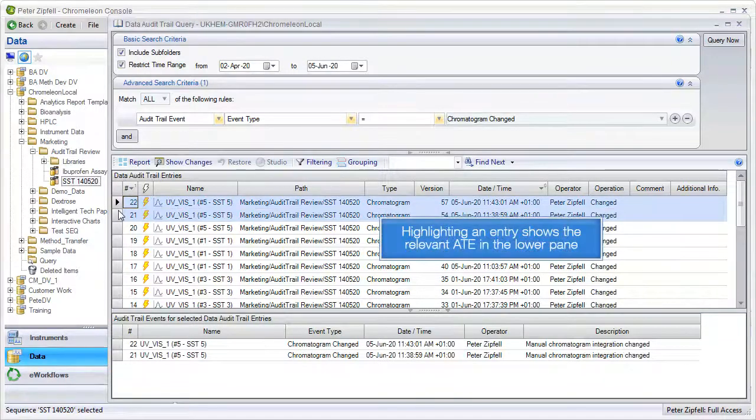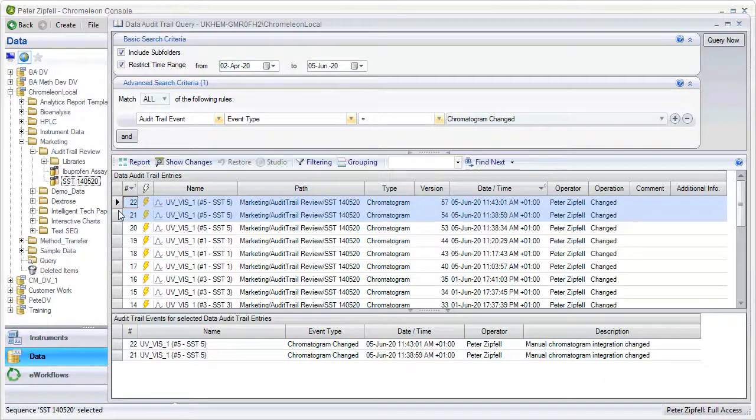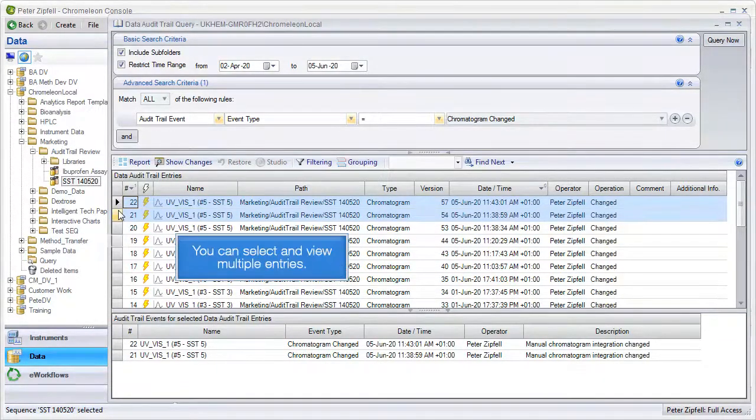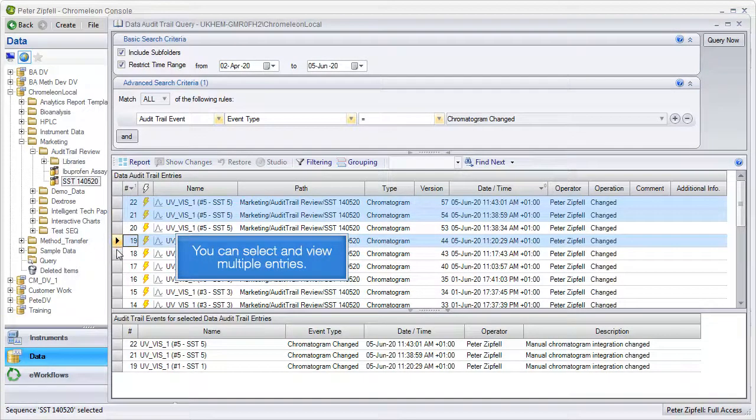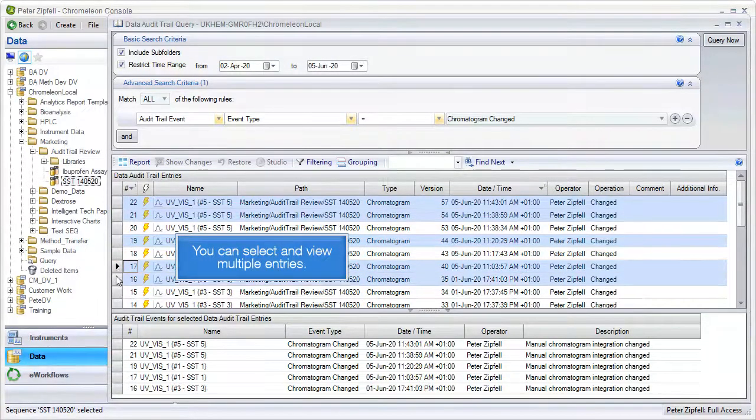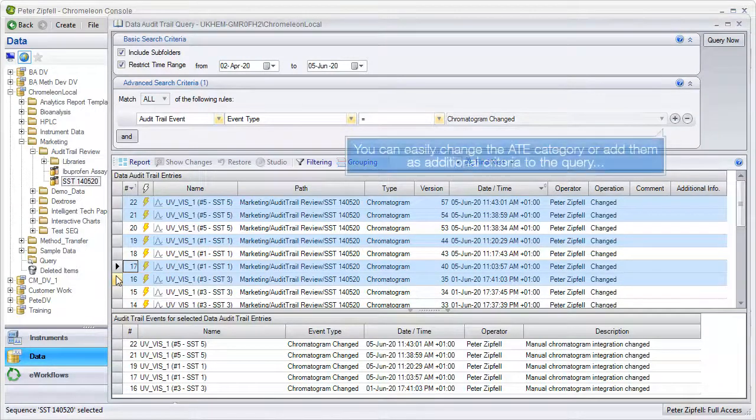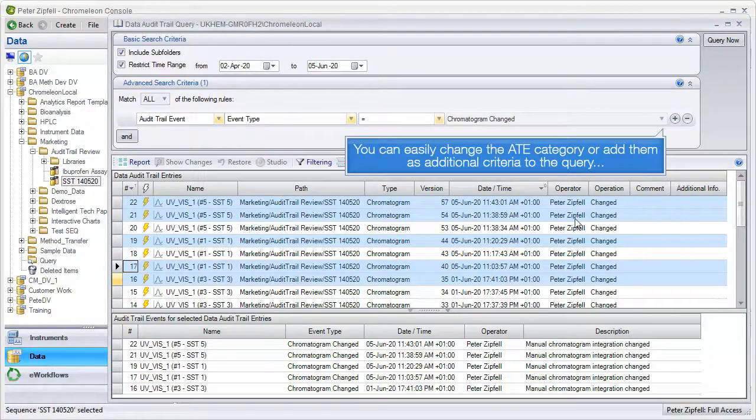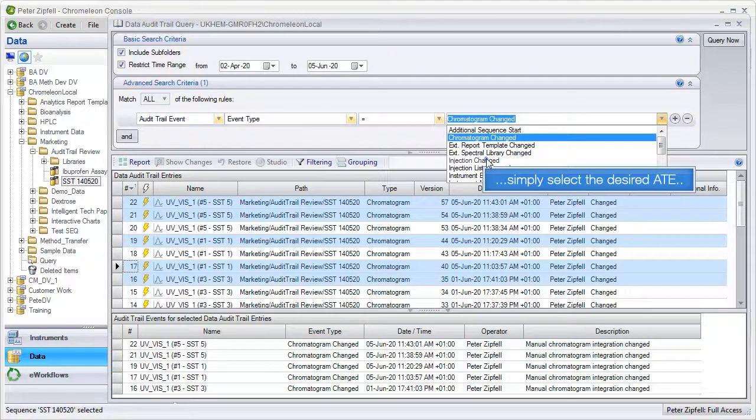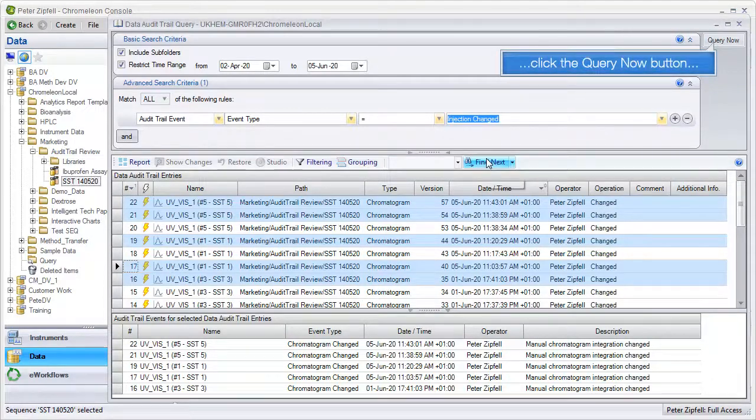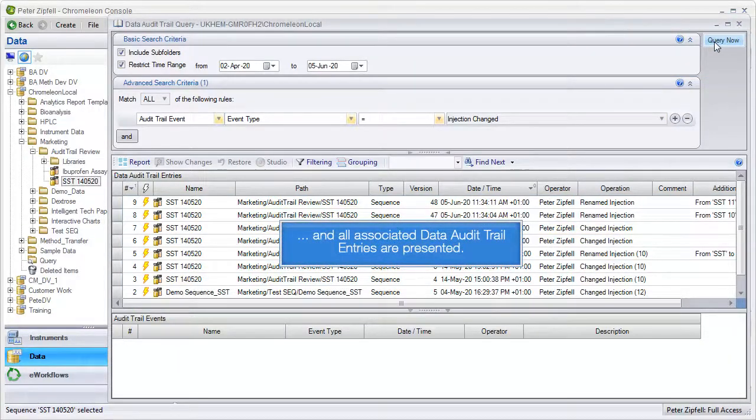Highlighting an entry shows the relevant ATE in the lower pane. You can select and view multiple entries. You can easily change the ATE category or add them as additional criteria to the query. Simply select the desired ATE, click the query now button, and all associated data audit trail entries are presented.